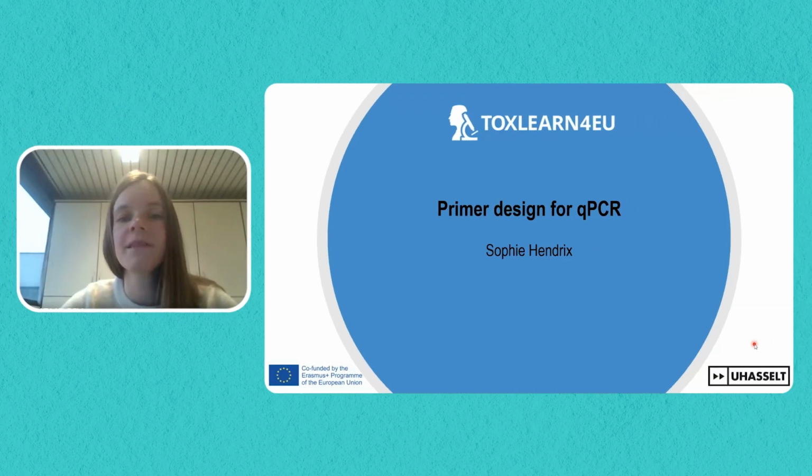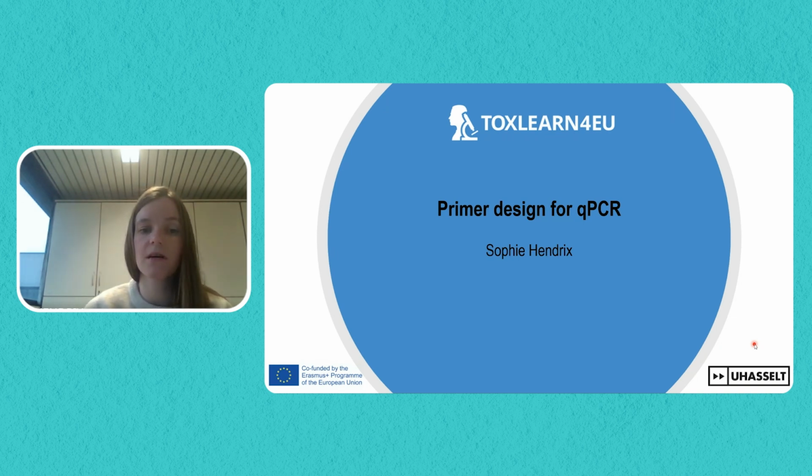Hello, everyone. During the previous lecture, I explained the basics of transcriptomics analysis and specifically of real-time PCR. And as we discussed, primer design is an important aspect related to qPCR. So that is what I will be explaining in more detail today. But before I start explaining which parameters are important to consider during primer design, I will first repeat some of the information from the previous lecture.